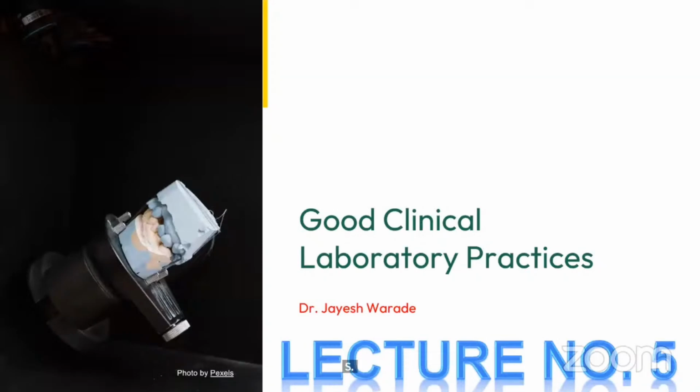So safety of me, safety of my staff, safety of the personnel who are visiting the laboratory for various purposes, vendors, third party suppliers, or whoever is in contract with the laboratory. Patients are coming to the laboratory, their relatives, attenders, and many times their guardians accompany them. So this safety is related to all the personnel who are visiting, working, or transiently visiting the laboratory for any purpose.